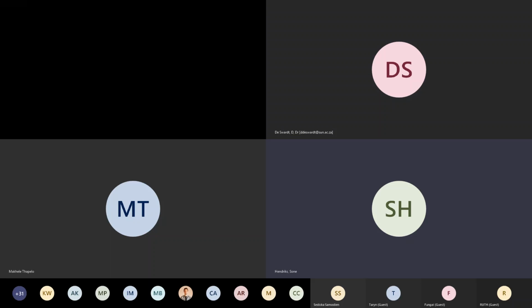Otherwise, I would always refer somebody to the most versatile tool, which you have in the SAF anyway, which is the confocal microscope. So yes, but please send an email to Anya if you would like us to have a more in-depth discussion about your particular project.